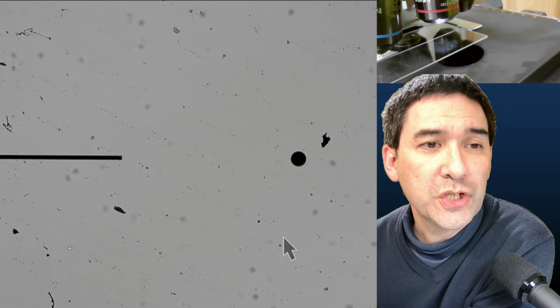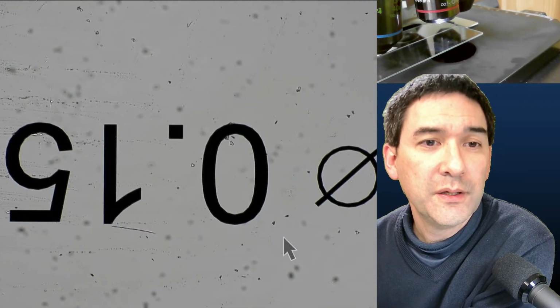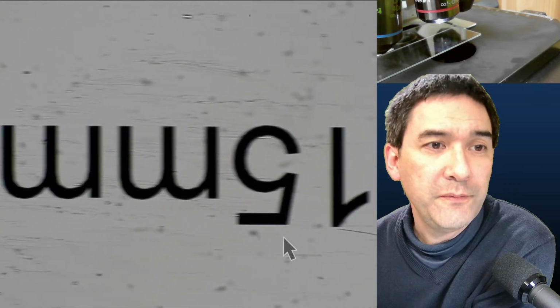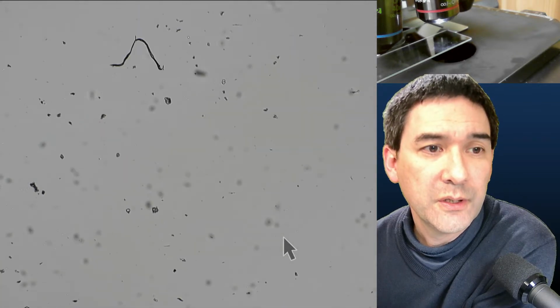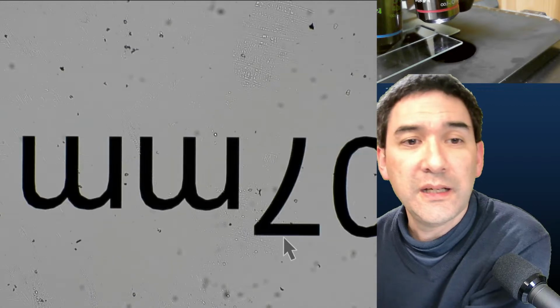It's a dot. What does it say here? The diameter of the dot is 0.15 millimeters. Let's see. The diameter is 0.07 millimeters. Where is this one? I don't know. This is not the one I want. We're already at the end.